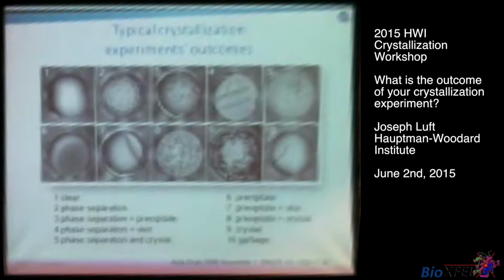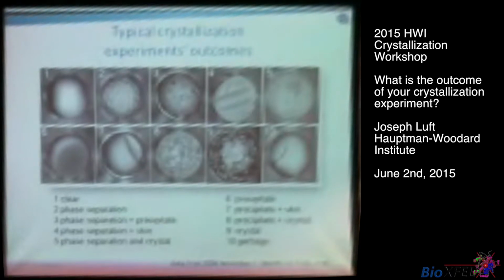These were reviewed by at least 3 people who confirmed that these were protein crystals, out of a set of people that were staggered, and I won't get into that, but it's the gold standard of visual classification of outcomes. So about 75,000 images out of 150,000 experimental images that were set up were actually used and classified as the gold standards.